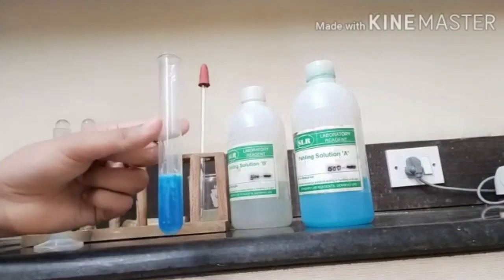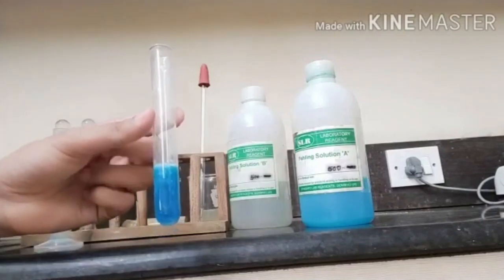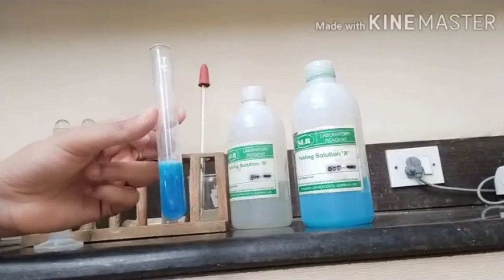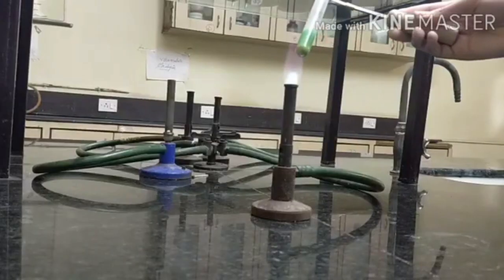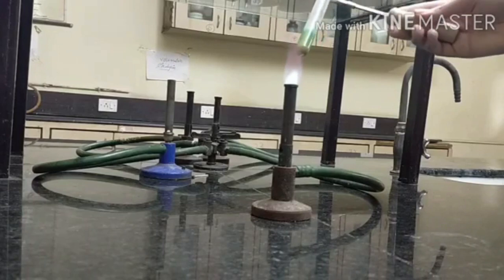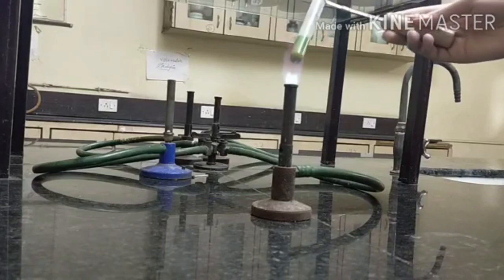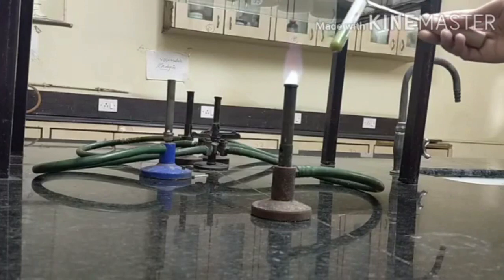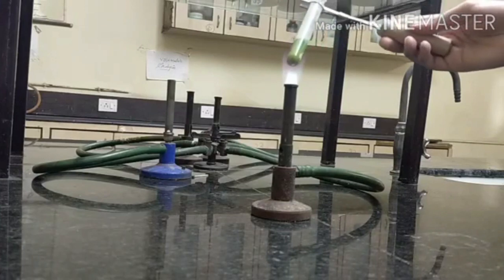This solution we will heat for a few seconds until the color is changed. Start boiling the solution. This test tube contains Fehling A, Fehling B solution and given unknown sample. Now, let's stop and check the reading here.